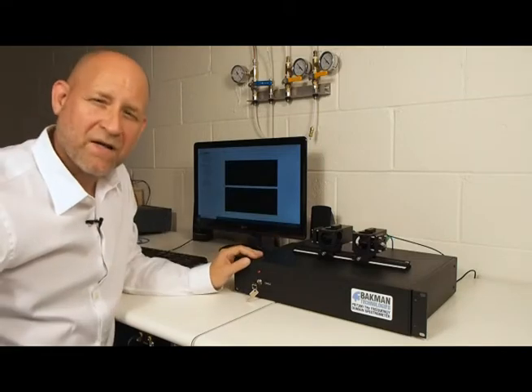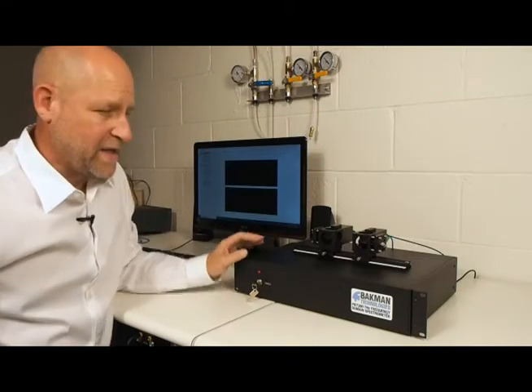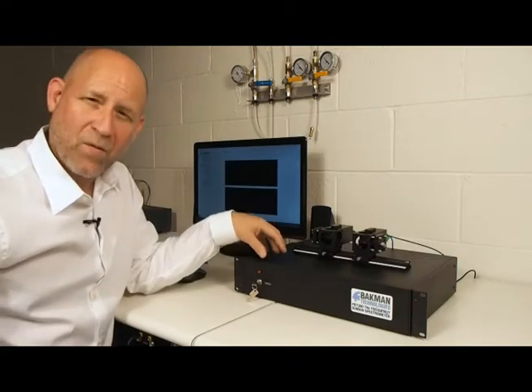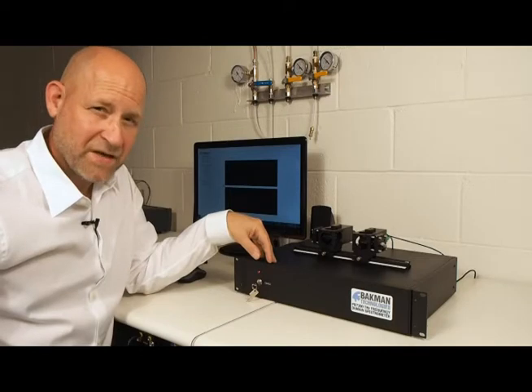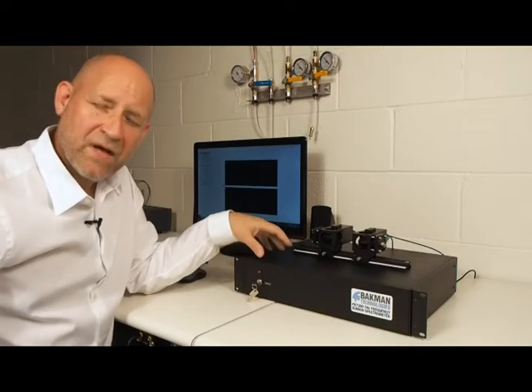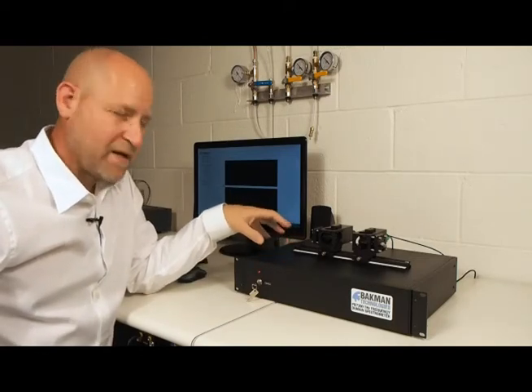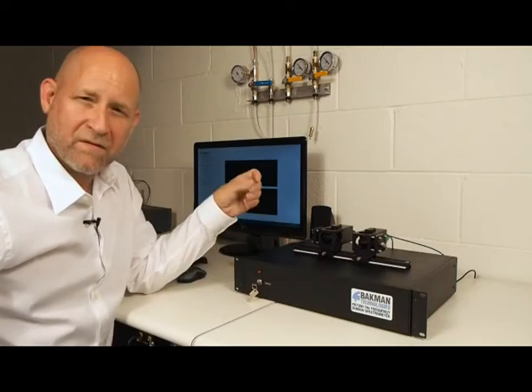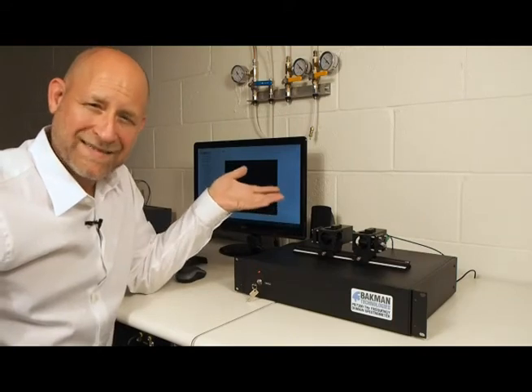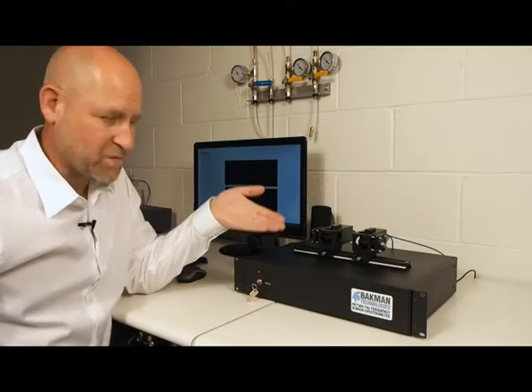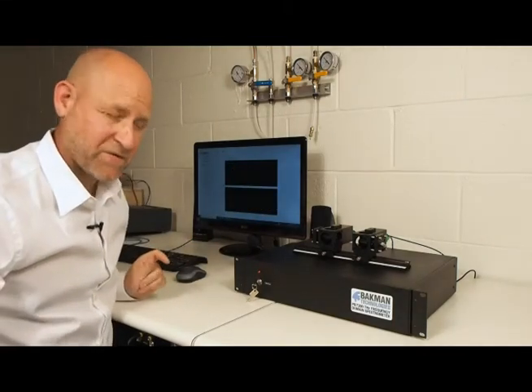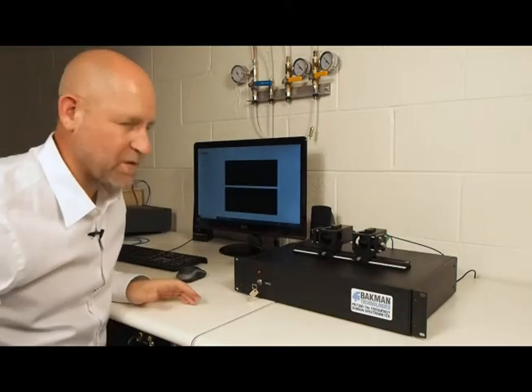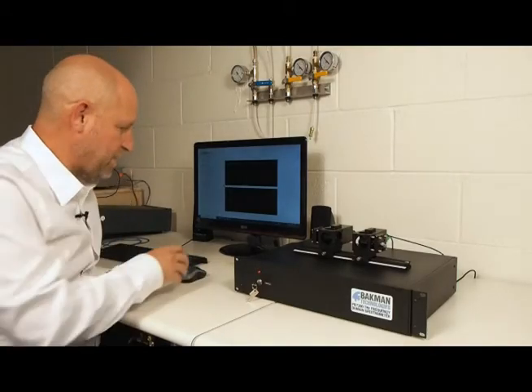Now those two harmonics are 90 degrees out of phase and therefore when you add them together after detection you can get rid of the pesky fringe pattern that occurs with standard homodyne detection techniques with the frequency domain terahertz spectrometers. So let me do a little demonstration now.